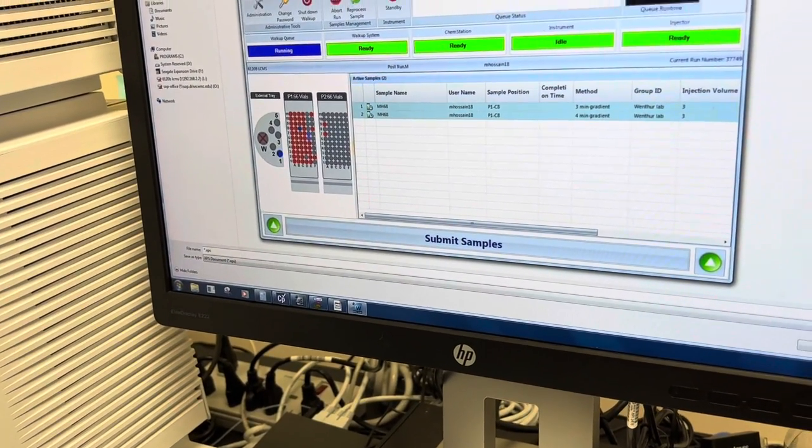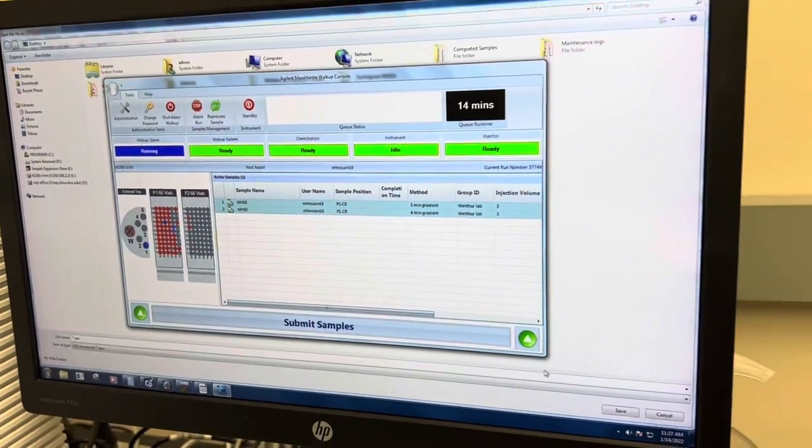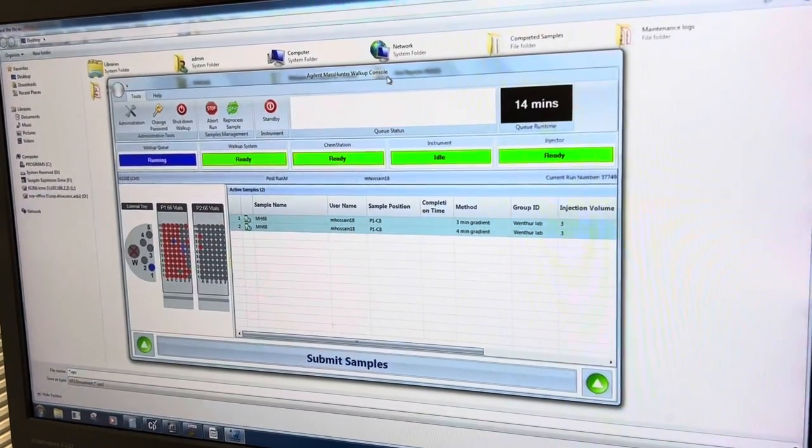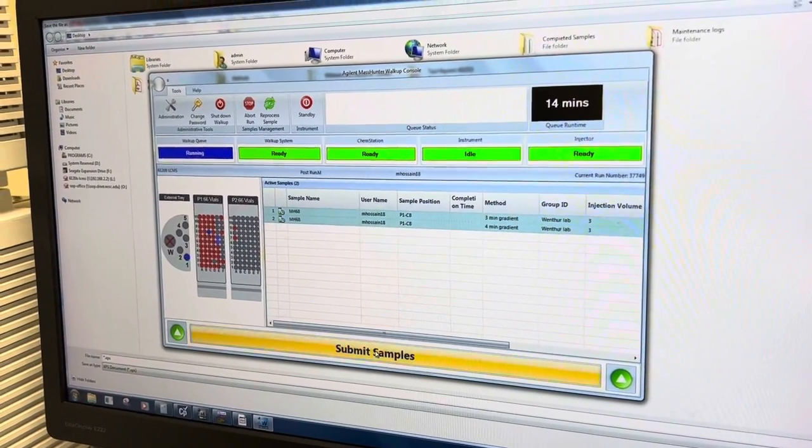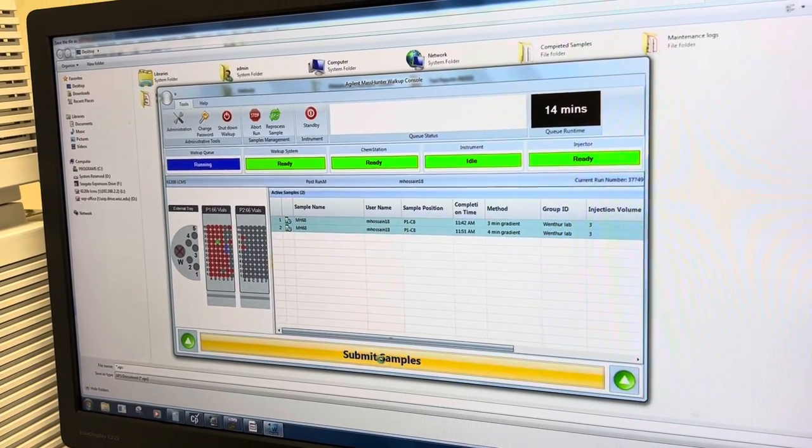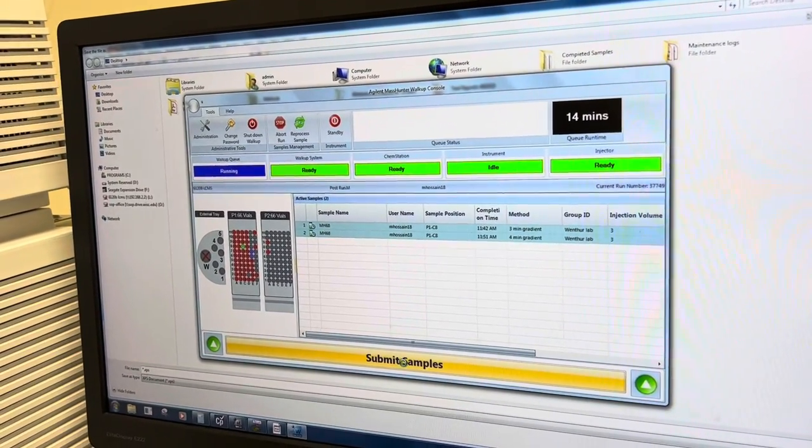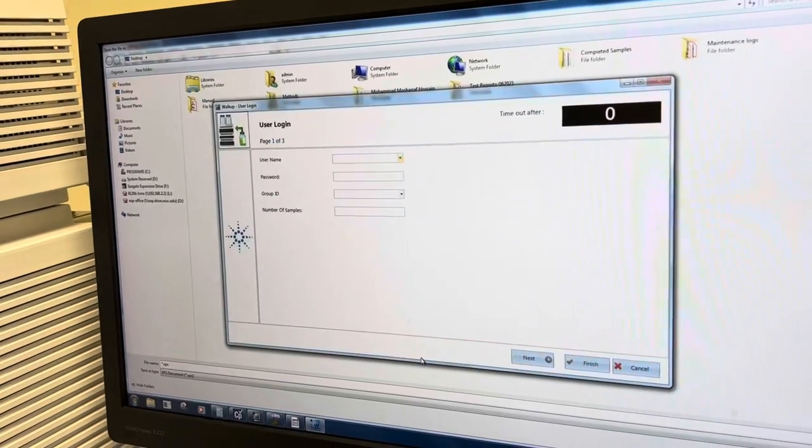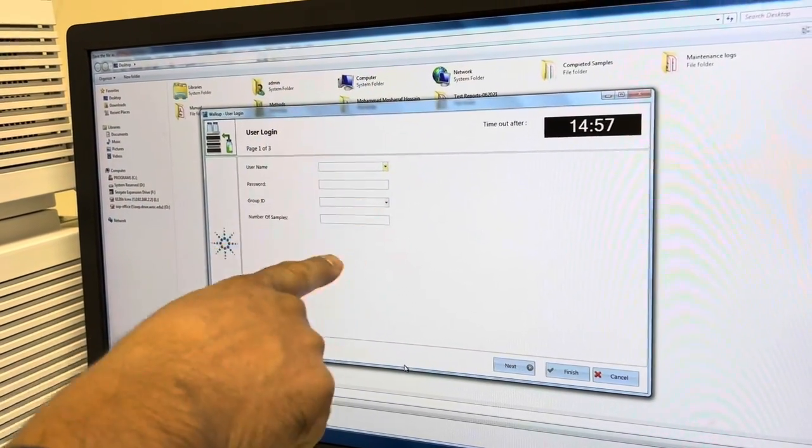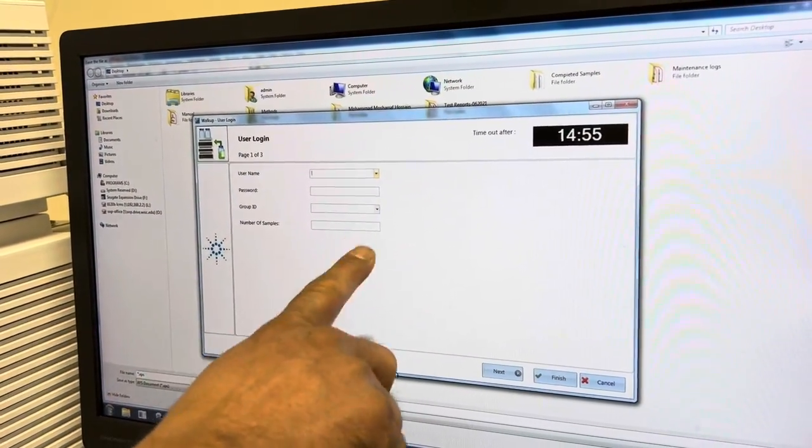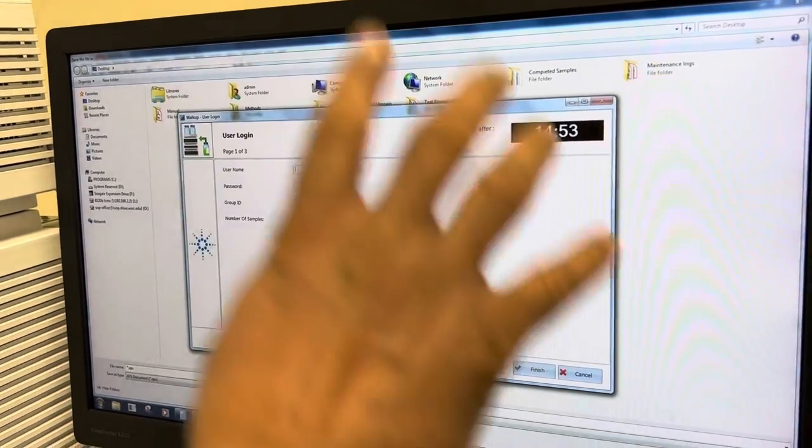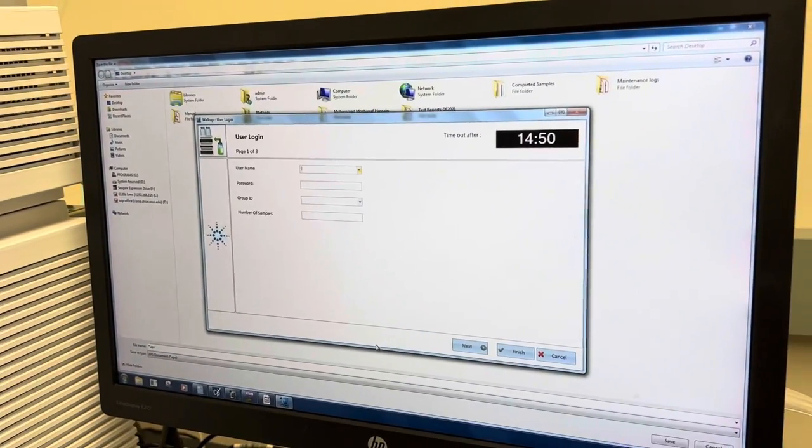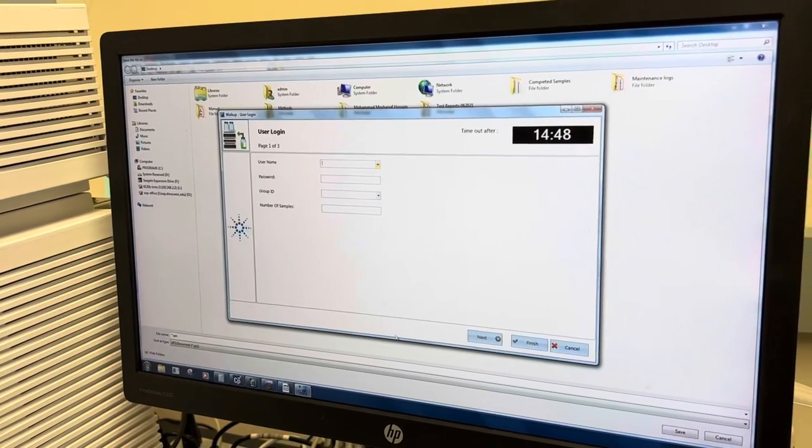It is already open, it was already open, okay. And you will always see this like Agilent Mass Hunter Worklist Console. So always you will get it like if you have this, just click submit sample. Suppose someone running the sample already, so you don't need to worry about it, you can just log in in your account, password, group ID and number of sample, then go next, next and select the method and the time and like finish, okay.